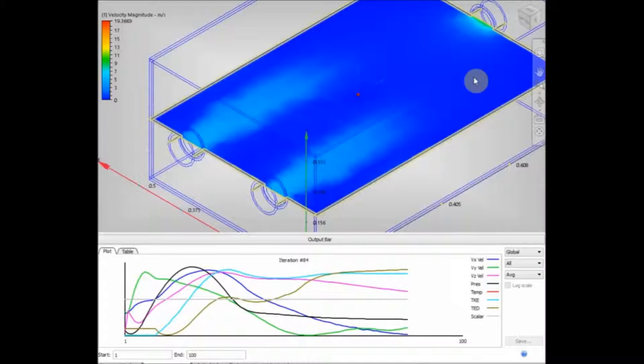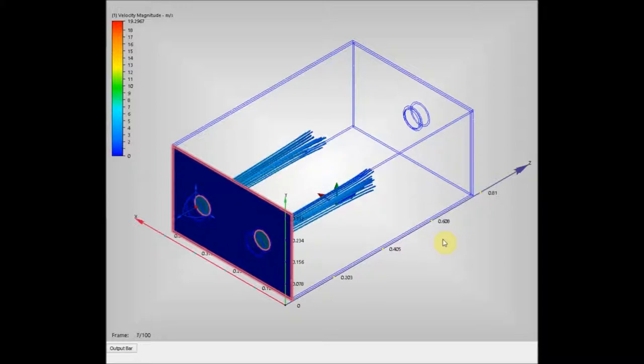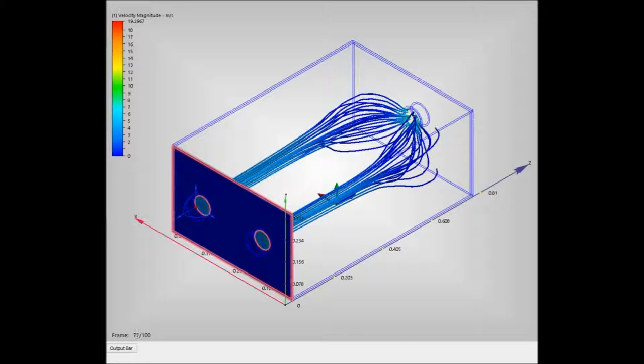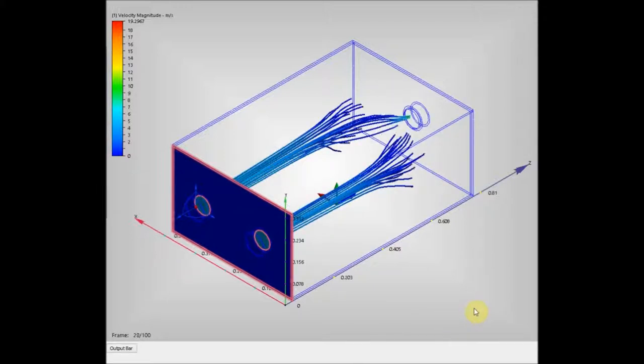What is interesting is when you look at the velocity scale on the left hand side, there's some really high numbers there, far higher numbers than a mosquito is going to be able to fly through. So this was quite an eye-opener for me because the calculation was always going to be a little bit high for the inlet and so I was prepared to bring the airspeed down as it comes through the actual main unit. But I was surprised by how high it actually is. It really is quite a lot higher than I thought it was going to be.